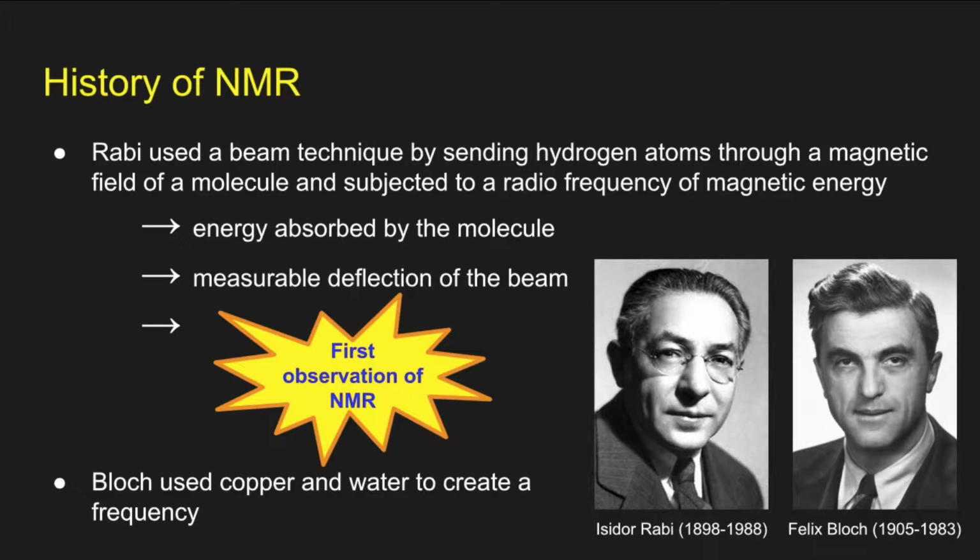In 1945, Stanford researcher Felix Bloch led an independent team that took a different approach to analyzing molecules. 1 cc of water was placed inside a glass bulb, which was wrapped around by a copper transmitter and receiver coil. These coils were optimized for a specific range of radio frequencies, which was about 8 megahertz.